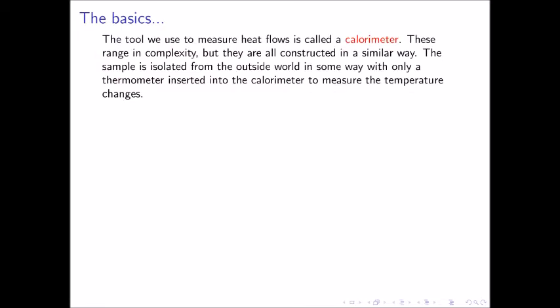The tool that we use to measure these heat flows is called a calorimeter. Calorimeters range in complexity from very complex to extremely simple, but they are all constructed in a very similar way. The sample must be isolated from the outside world in some way, with only a thermometer inserted into the calorimeter to measure the temperature changes.